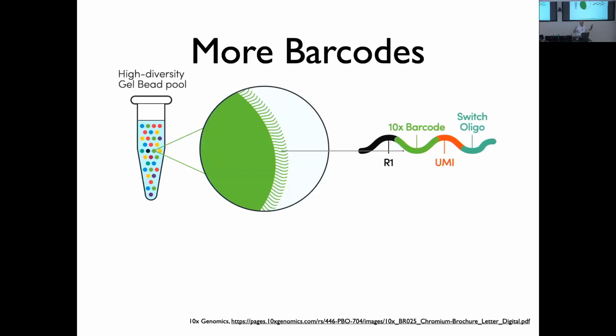If it's from the same RNA molecule that just got amplified in PCR, I only want to count each RNA molecule once. So if I see 1,000 reads of glucose 6-phosphate dehydrogenase and they're all from the same original RNA molecule, then that's going to count as one. If they came from 3 different RNA molecules, and I'm seeing about 300 of each of them, then I can count that as 3. And if it's from 1,000 different RNA molecules, I'm going to count that as 1,000.